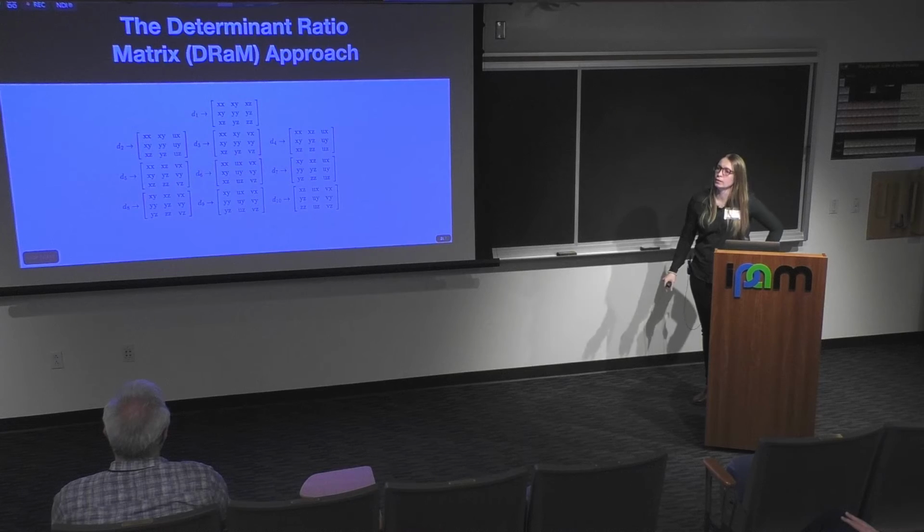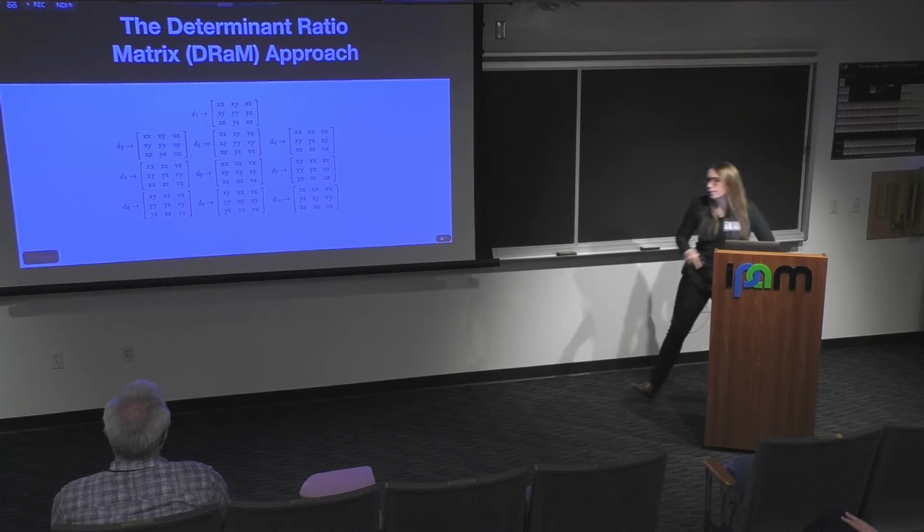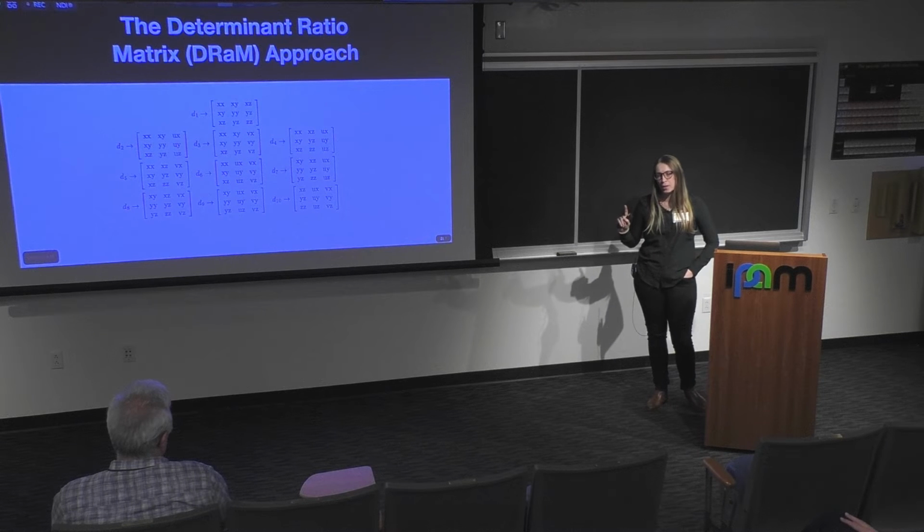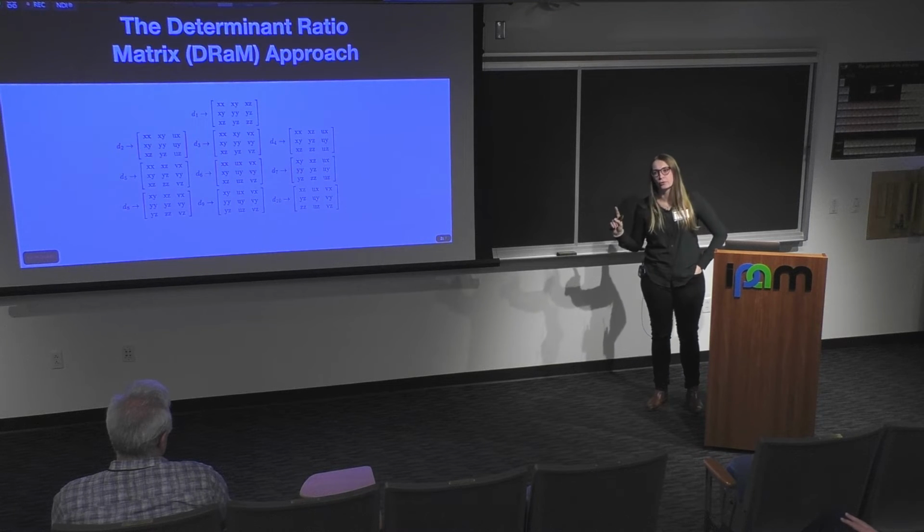So you're estimating the pose actually under which the projection happens here? Sorry? You're estimating the pose under which the projection happens. So the rotation, and then you have an orthogonal projection. Yes? Yeah. Is that a non-convex problem? Sorry? That's a non-convex optimization problem you're solving, right? So once again, because we have matched points, it makes it a solvable problem. And that's why we can get this analytical solution. Otherwise, it's a much harder problem. I agree. But yeah, so sorry, go ahead.